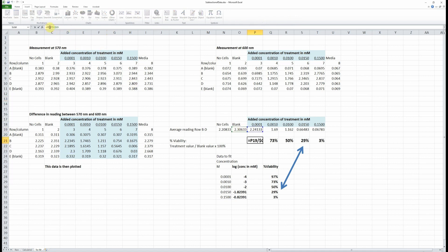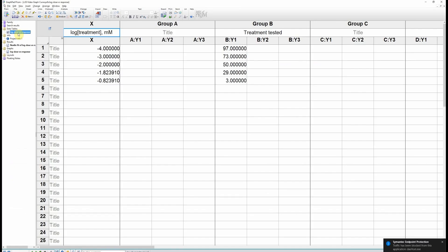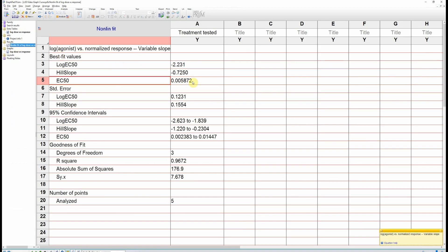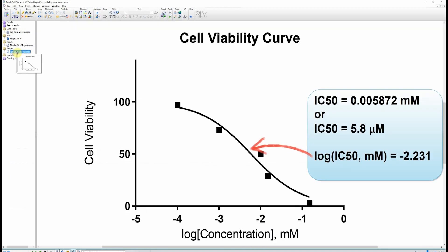Plot the log of the concentration versus the percentage viability and fit to a sigmoidal curve. The concentration at the point of inflection is your IC50. You can get more information on our website. The Open Data Fit team thanks you for watching and we hope you found this video useful.